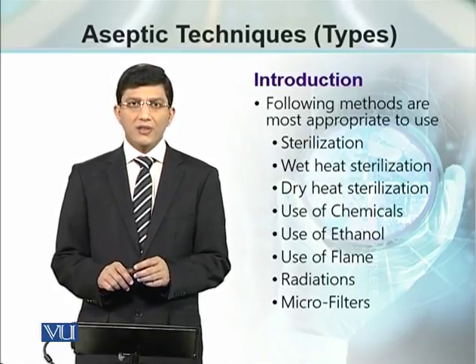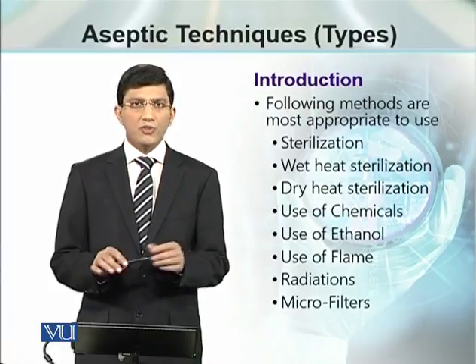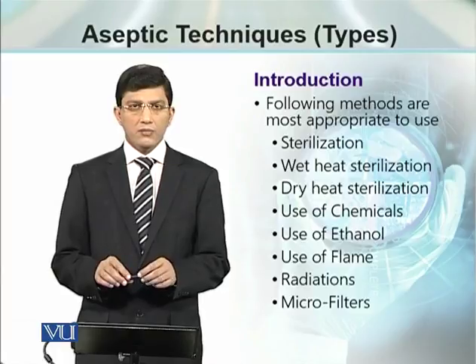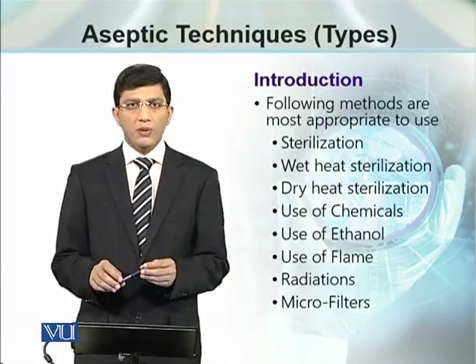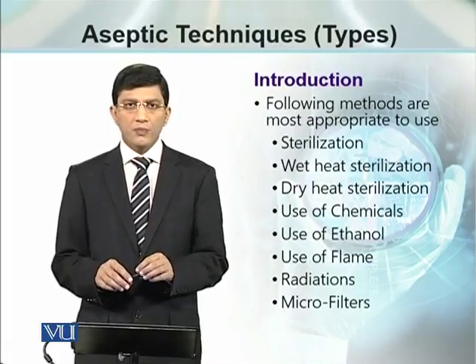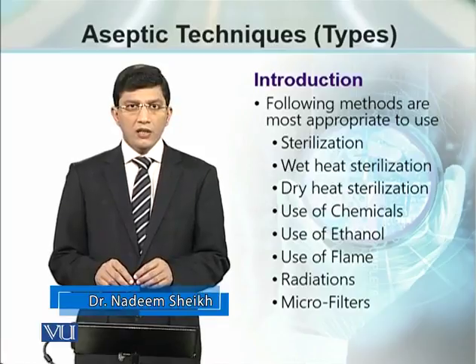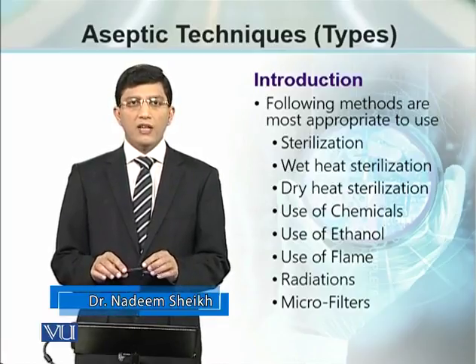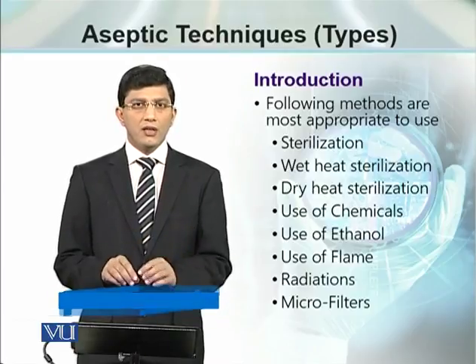use of different filters. While working in the laboratory, we sometimes have very small pieces of equipment like micropipettes. We work on the benches which are quite big. So we have to make sure which method is used for which particular equipment.